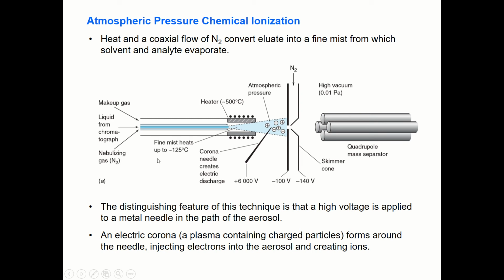You see, your sample from the liquid chromatograph now enters this needle. Then here you also flow nitrogen gas, dry nitrogen gas.